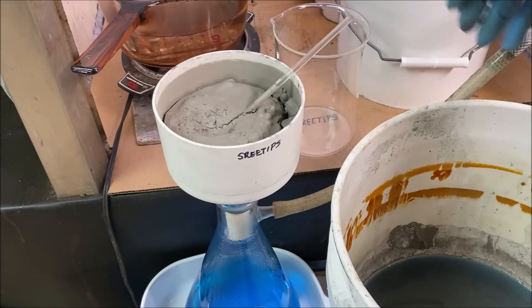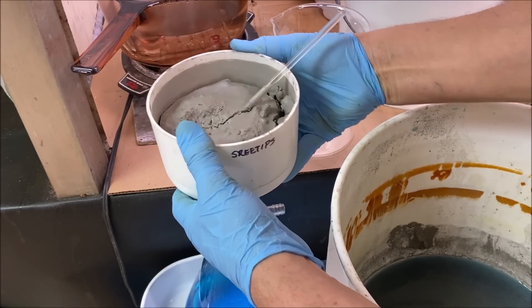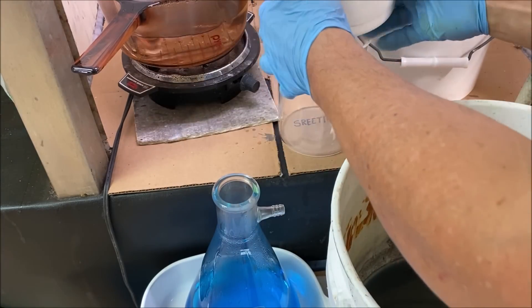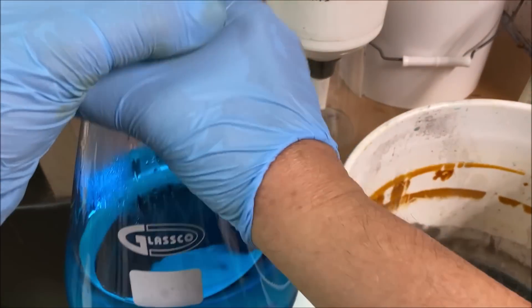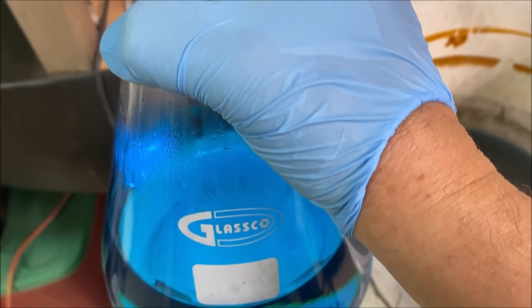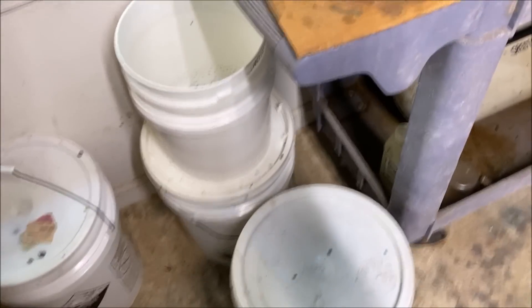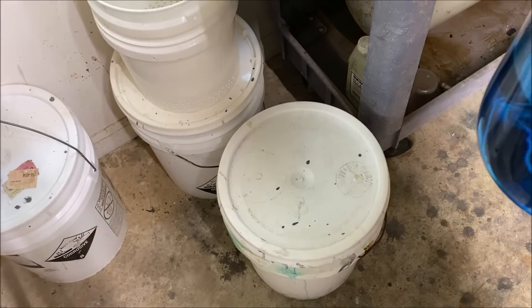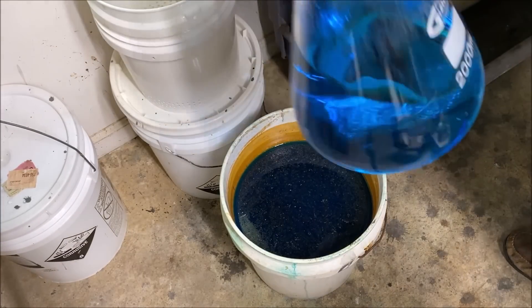Now we'll take our filter off of here and set it out of the way temporarily. This blue liquid is going to be full of copper. I've got a bucket set up over here for all my copper solutions — it's full of copper itself — and I add this liquid to that bucket.